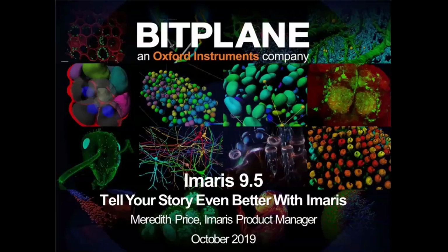So Elena is asking, I hope I pronounced your name correctly, apologies if I didn't, if you're able to export this rendering data to reconstruct it in Imaris or outside of Imaris. There are some steps for doing that. After this is over, I will send you some information about how to do that, and we will make sure to get that up on the web as well. So there is a way.